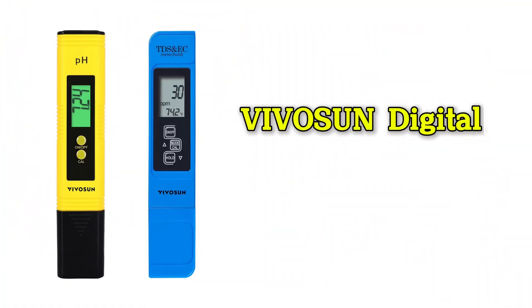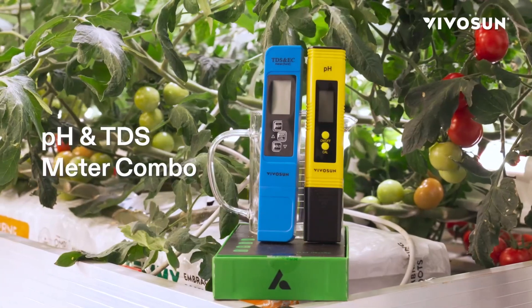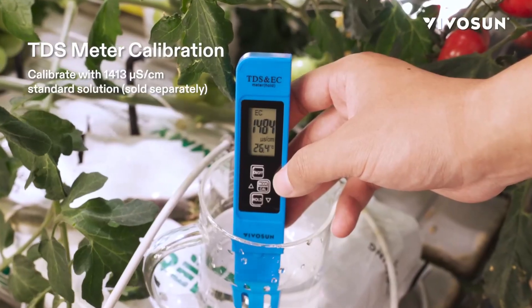Number one: the digital pH and TDS meter kit by Vivosun. This Vivosun kit is not just any pair of meters — it's a complete solution for water monitoring. Let's break down what makes it so useful.